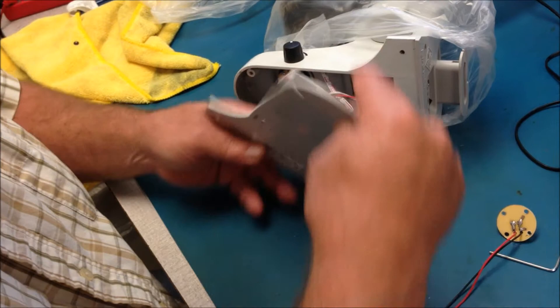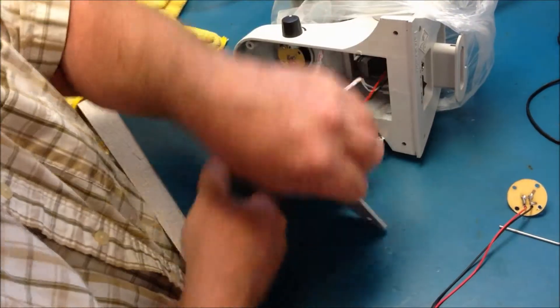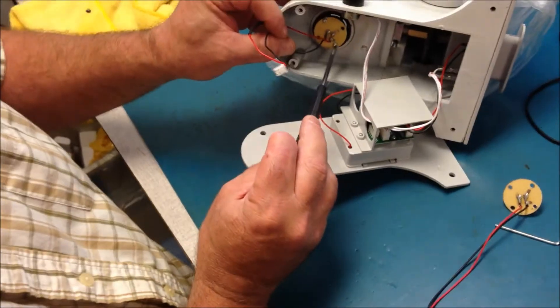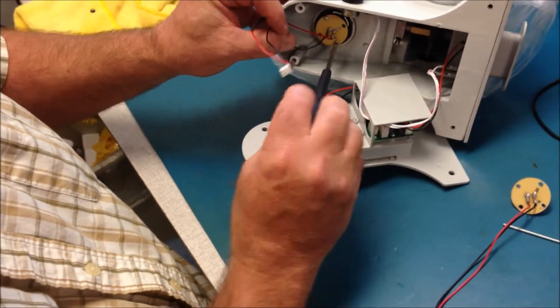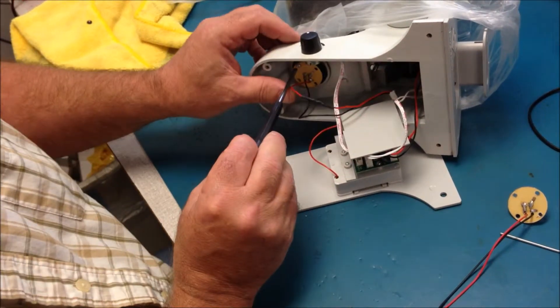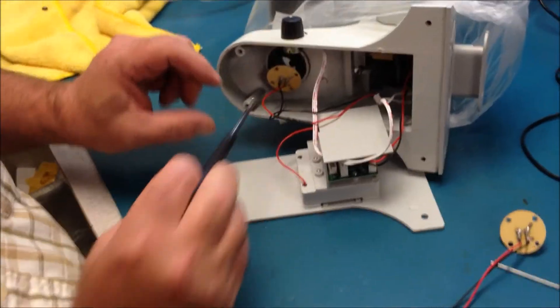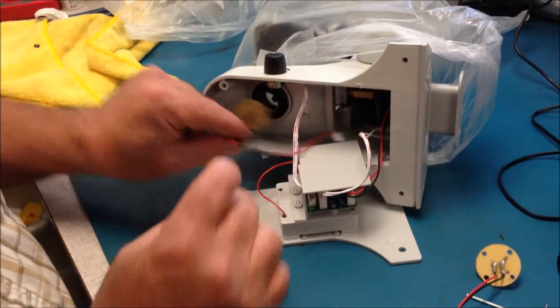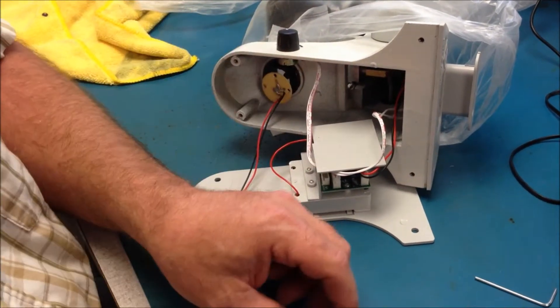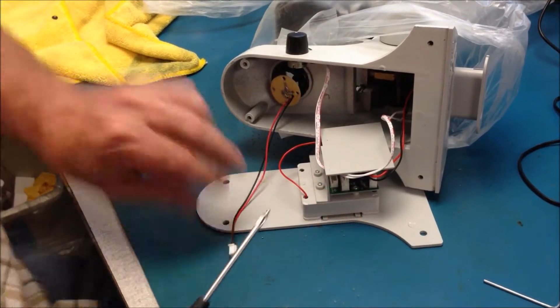Open the base of the microscope and disconnect the power board wire connected. You will have two screws that will need to be removed. Now the old light board can be removed easily and you can replace it with a new light board.